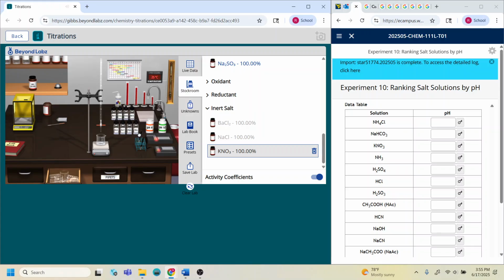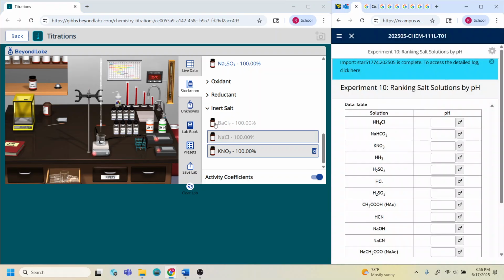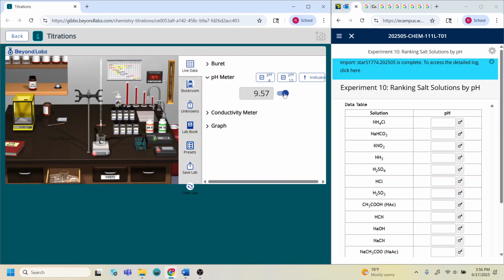After we do this, we're going to put the pH meter inside, and we are going to start stirring. So when you start stirring, the solid is going to dissolve. The 0.1 molar solution is going to form. So after the 0.1 solution forms over here, we're going to go ahead and measure the pH. This is sodium bicarbonate. The value of the pH should be very close to the one that you predicted. So go ahead and report it over here.